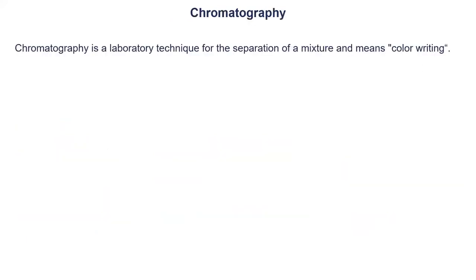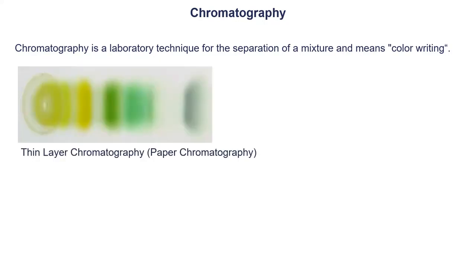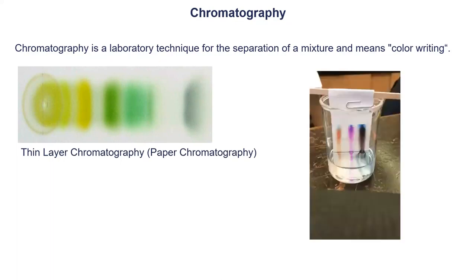And I talked already a lot about LC, GC, and so on. Here I want to highlight the basic idea of chromatography, and it's just very brief. So in the past, a lot of people used, for example, thin layer chromatography. The basic idea is to separate compounds based on their interaction with the stationary phase and with the mobile phase. And then we see nicely in this image that, based on the color, the compounds have a different retention on the silica gel.